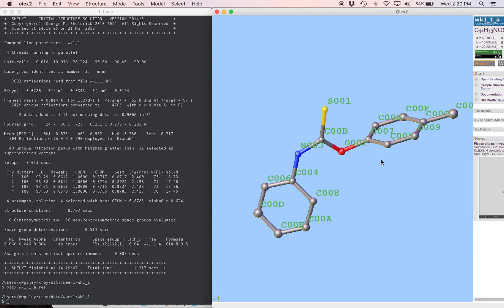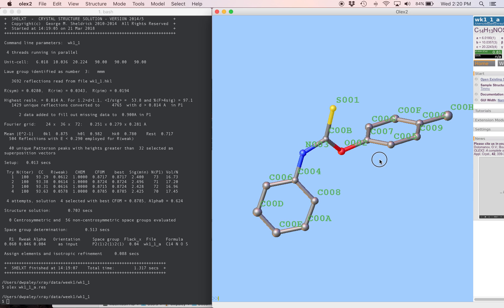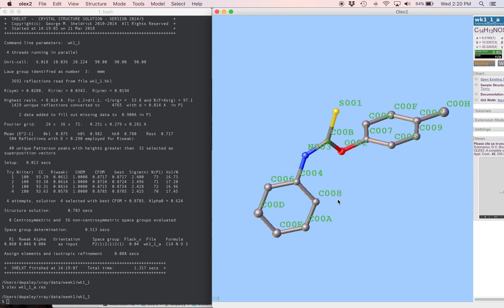So first I'm going to type labels so that we can see how they're named currently. And what you get from ShellXT is pretty arbitrary names. Everything gets a three-digit number, and they don't go in any particular order. So the first Olex trick for naming atoms is to select the atom, type the word name, and give the name that you want. This is carbon1, this is sulfur1.